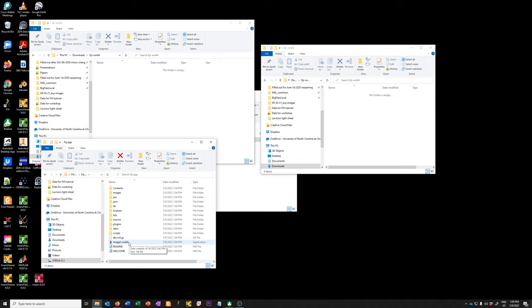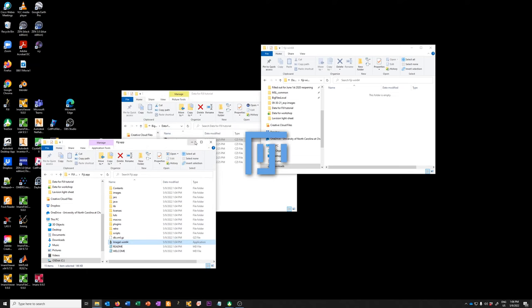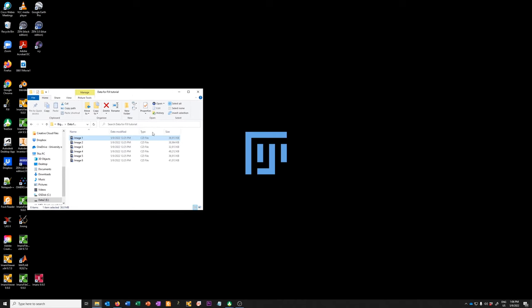We can start the software by double-clicking on the ImageJ icon. If you have some confusion about what Fiji is versus ImageJ: Fiji is essentially a version of ImageJ that has a bunch of useful plugins included — including ones you will use today to open microscope images.